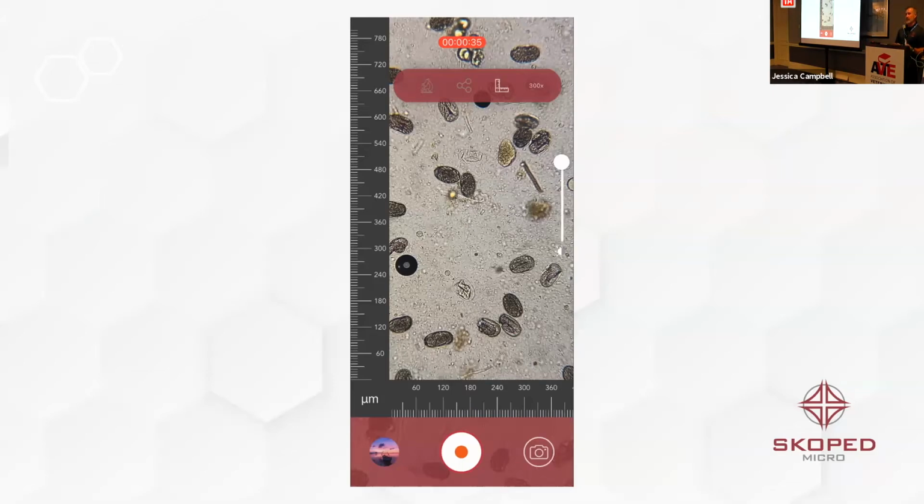And then the other thing was my parasitologist's biggest gripe with people who send pictures, but there's no scale. How big is that? And if somebody says, oh, that was 40X, was it? So it's hard to know. And there are some things that look very similar, but are different sizes. So I started working on that.